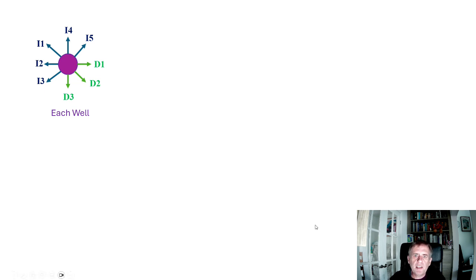You might have, say, up to 5 independent variables. These could be all numbers, where this is a dose or a time point, or it could be a cell line identity, a name. All these variables need to be captured. But also you might, if you're doing a high content screening experiment, have simultaneous dependent variables or measurements coming from the well. So you have a very complex data set.